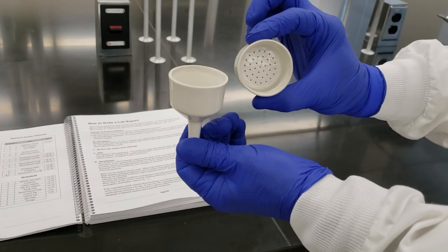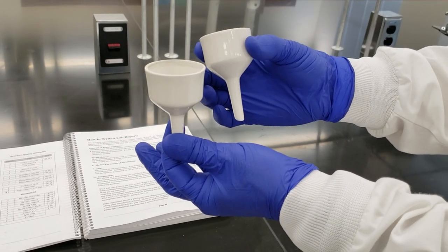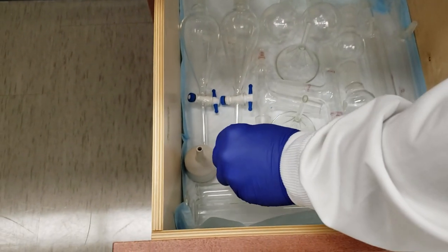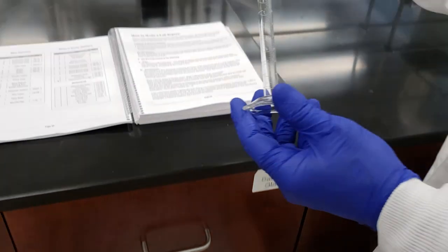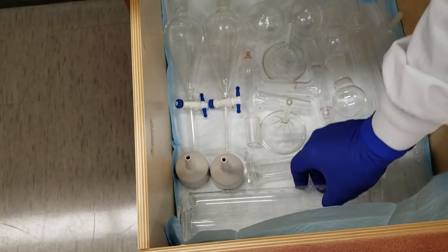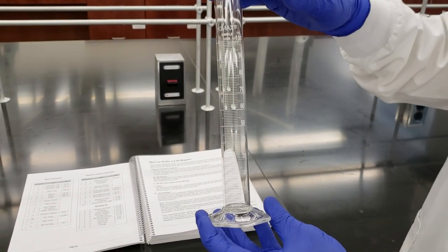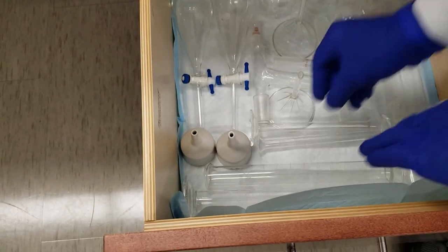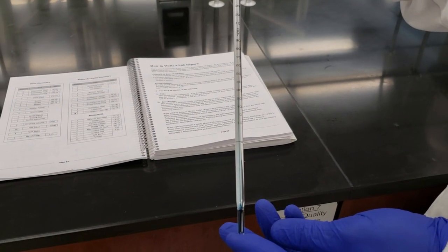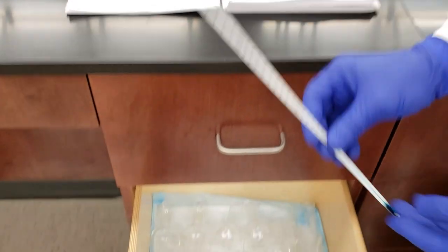We have two Buchner funnels for suction filtration to isolate purified product during experiments, used with the filter flask from drawer one. We've got two graduated cylinders, a 10 mL for more precise measurements and a 100 mL for greater volume. Last but not least, we have two alcohol thermometers for various purposes during the semester. That's it for drawer number two.